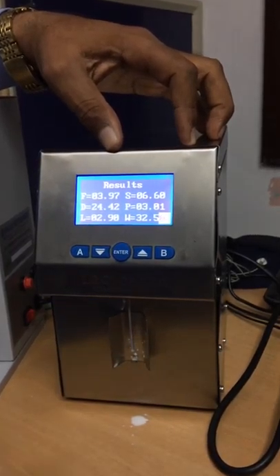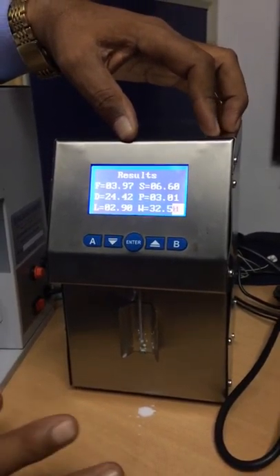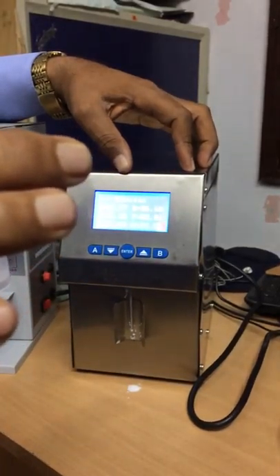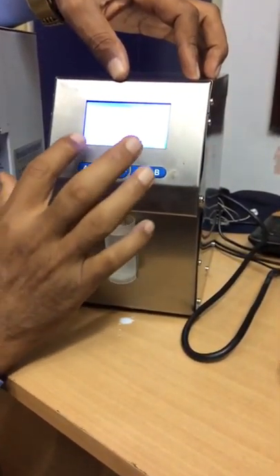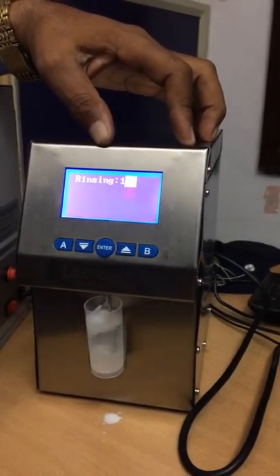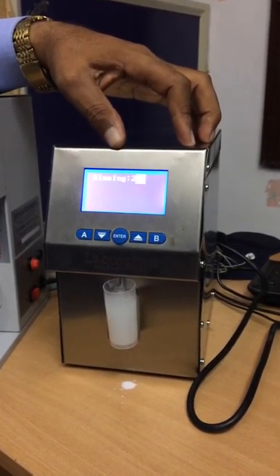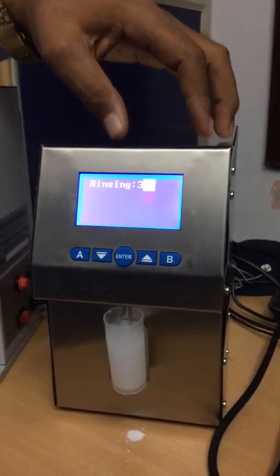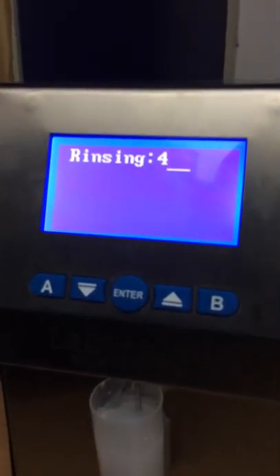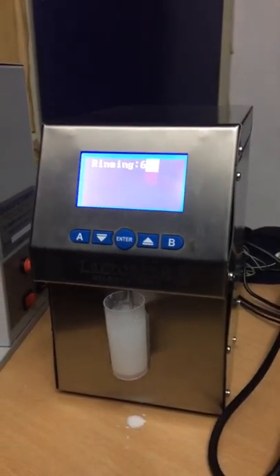Likewise you can test mixed milk also. A very important thing is: whenever you analyze the milk you should clean the machine. For that I take fresh water and press the B button. The B button is pre-configured for cleaning.